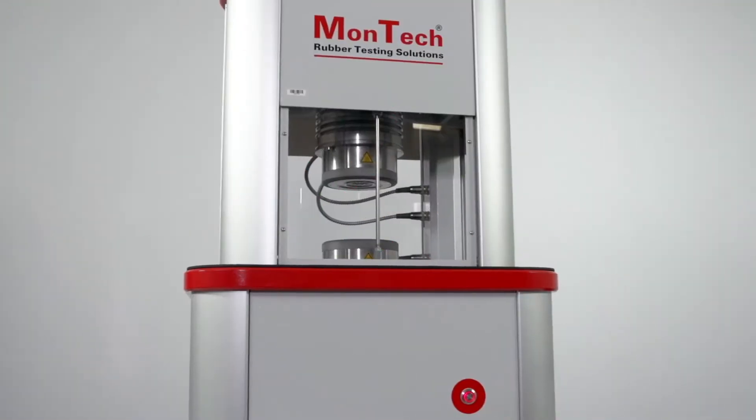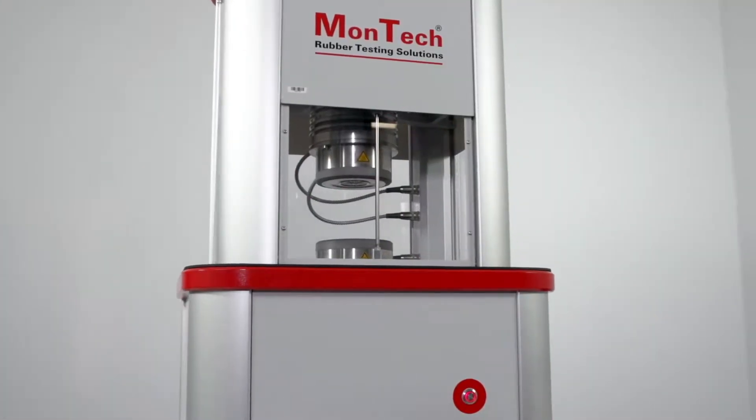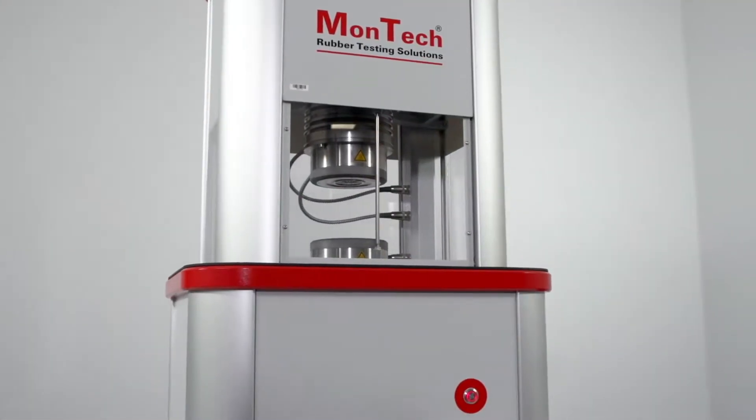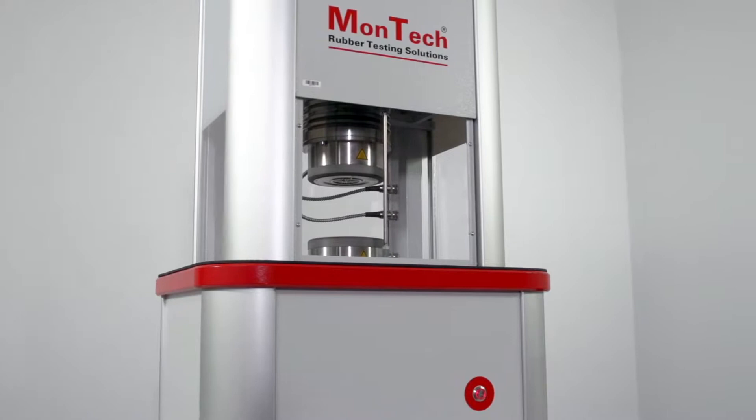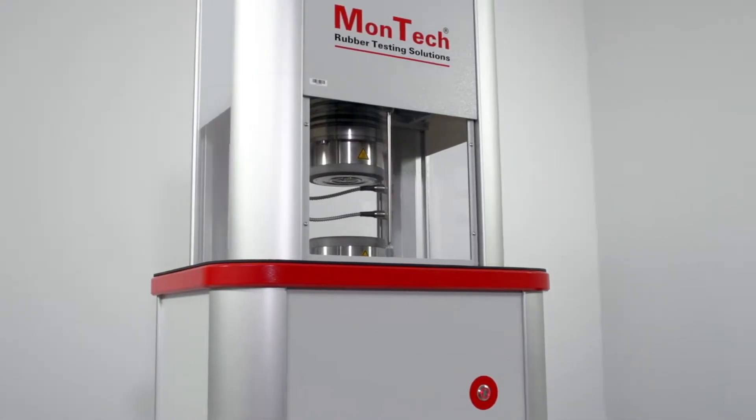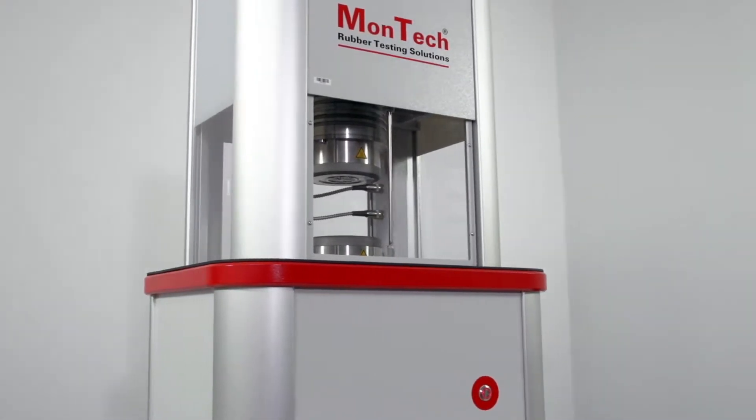Featuring a compact, rugged construction, the MDR3000 Basic can be used in the laboratory or the production area.